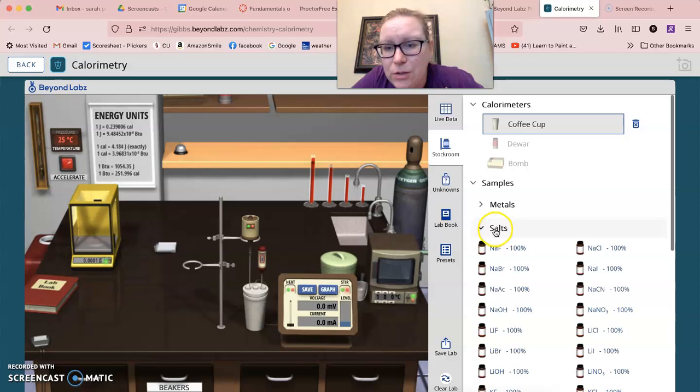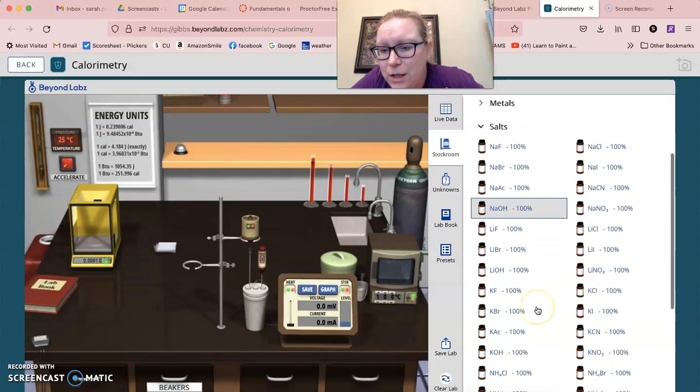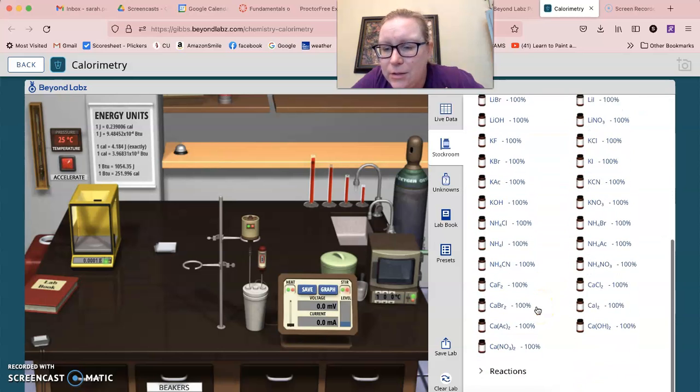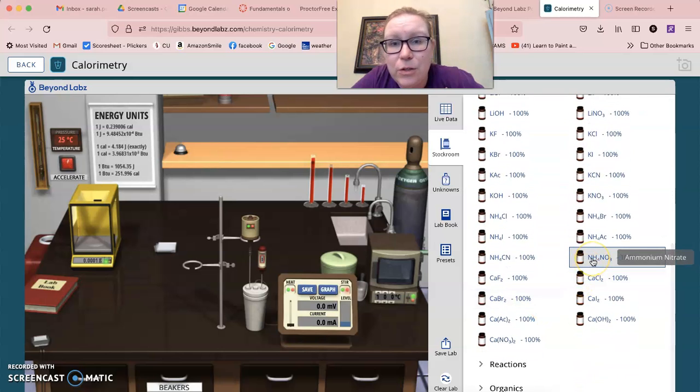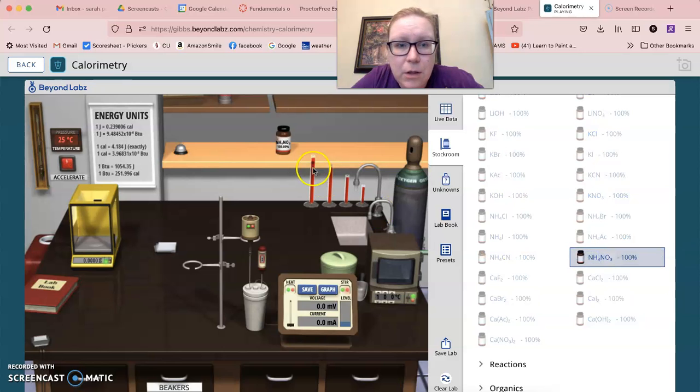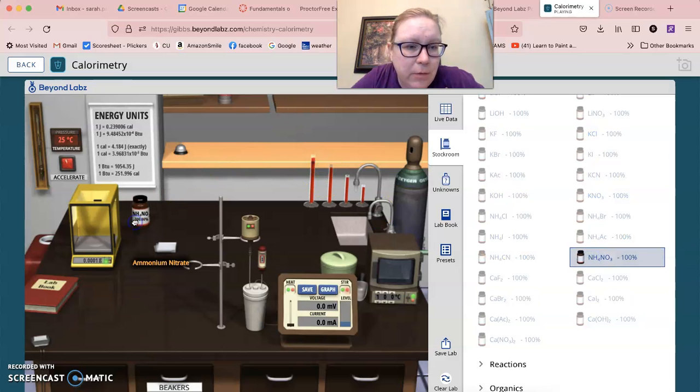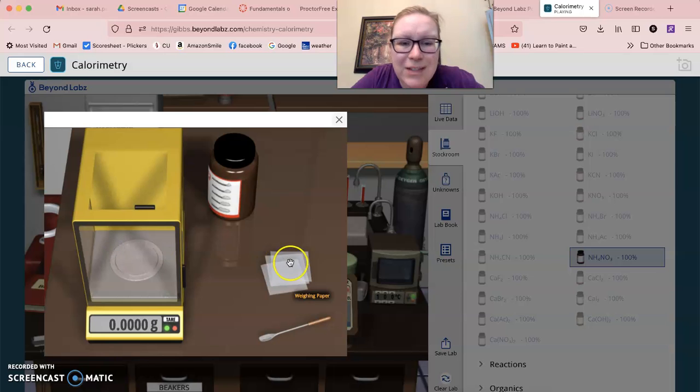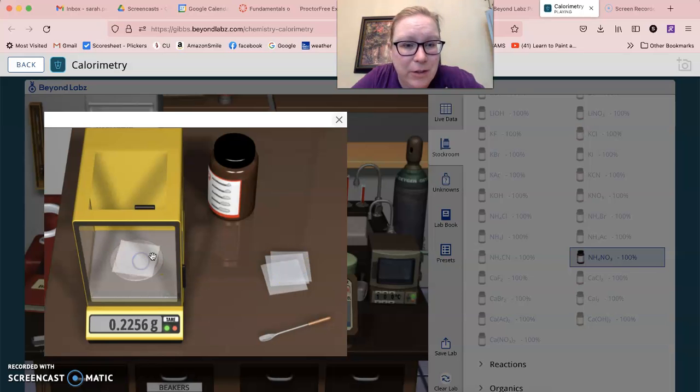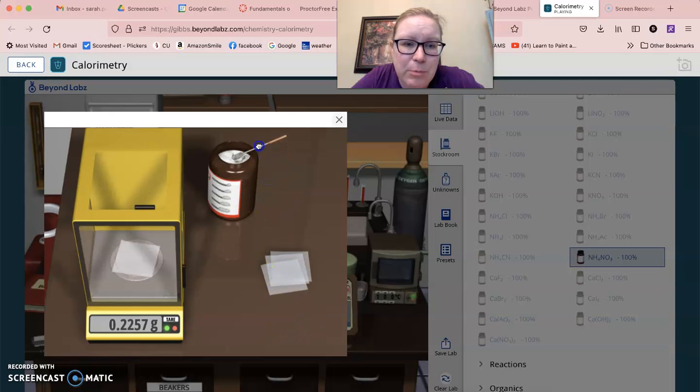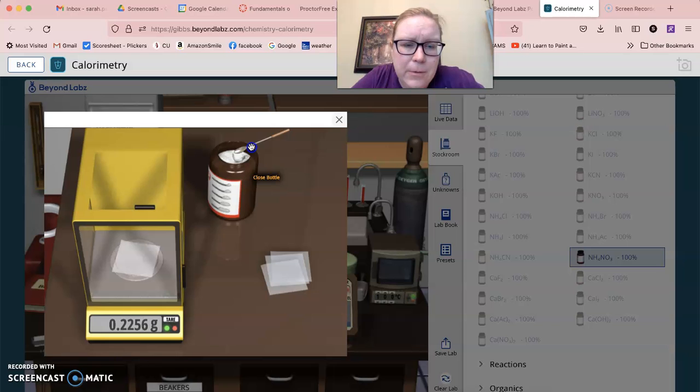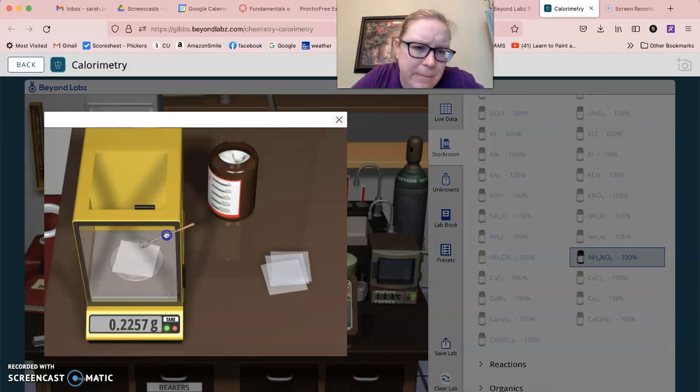And we're going to go to salt. What you're going to see here is the first one we're going to use is ammonium nitrate. We're going to drag ammonium nitrate over here. You need to get about two grams of ammonium nitrate, so we're going to remove the lid, we're going to take the scoop, and we're going to let it sit here and fill up.